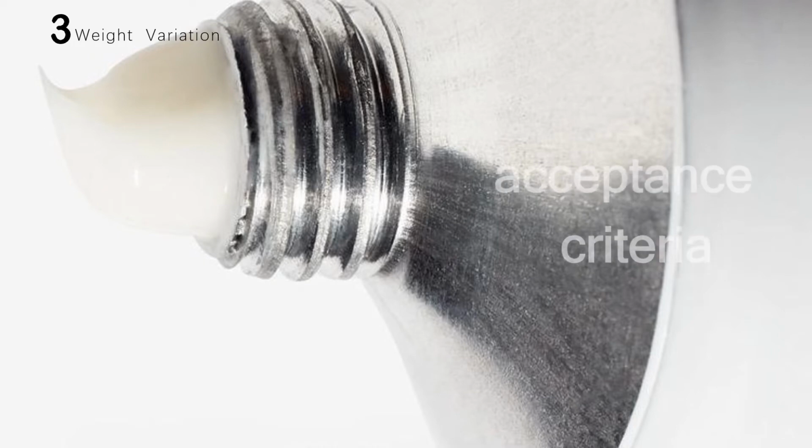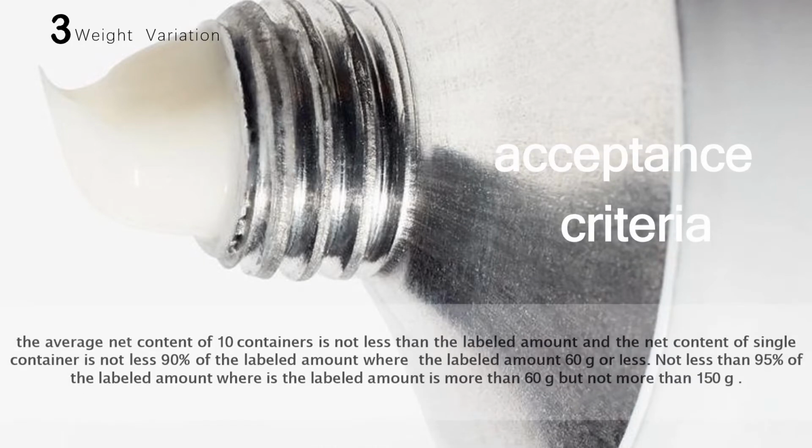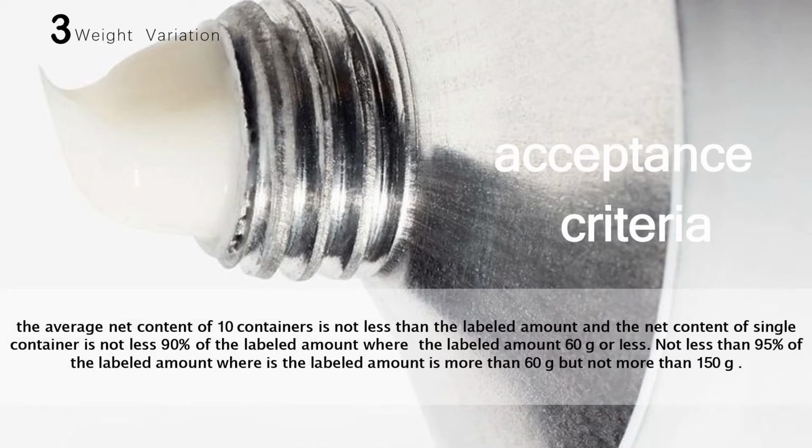Acceptance criteria: the average net content of 10 containers is not less than the labeled amount, and the net content of a single container is not less than 90% of the labeled amount, where the labeled amount is 60 gram or less. Not less than 95% of the labeled amount, where the labeled amount is more than 60 gram but not more than 150 gram.